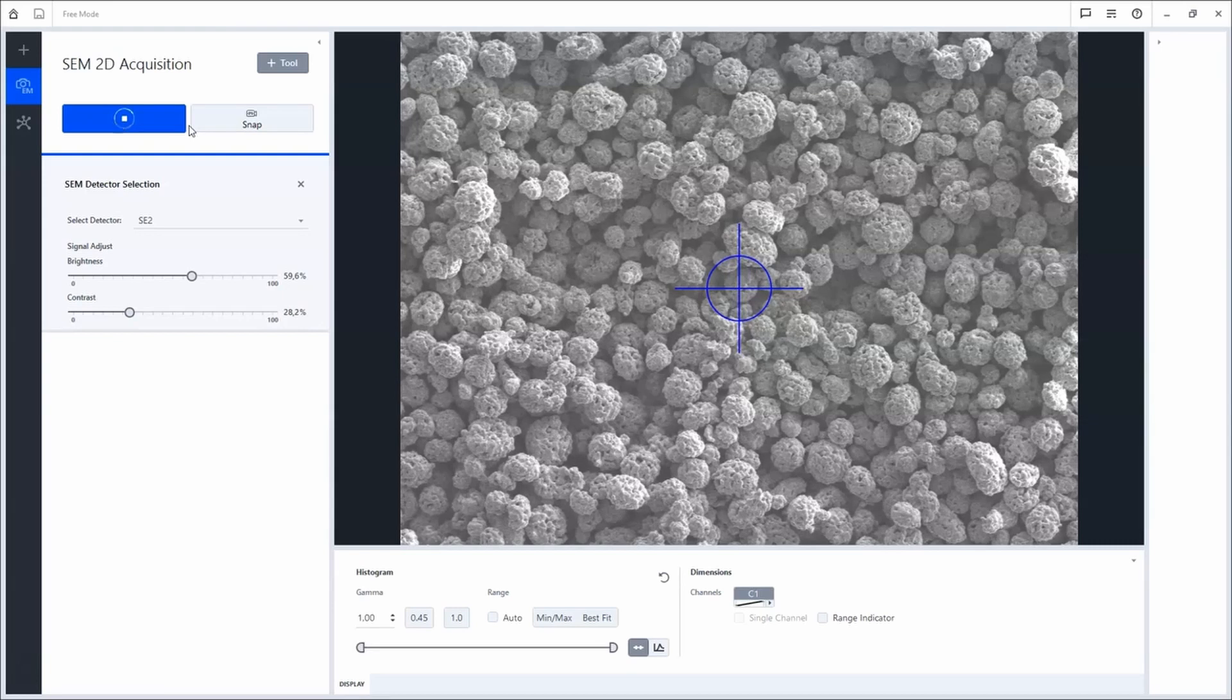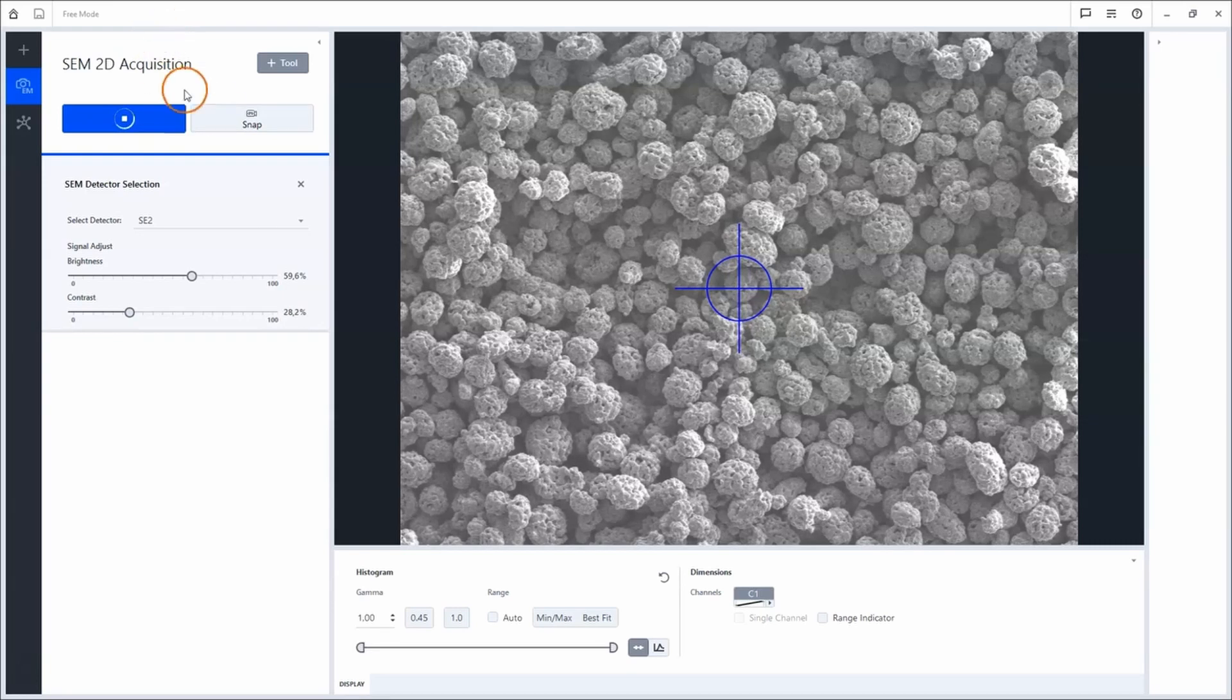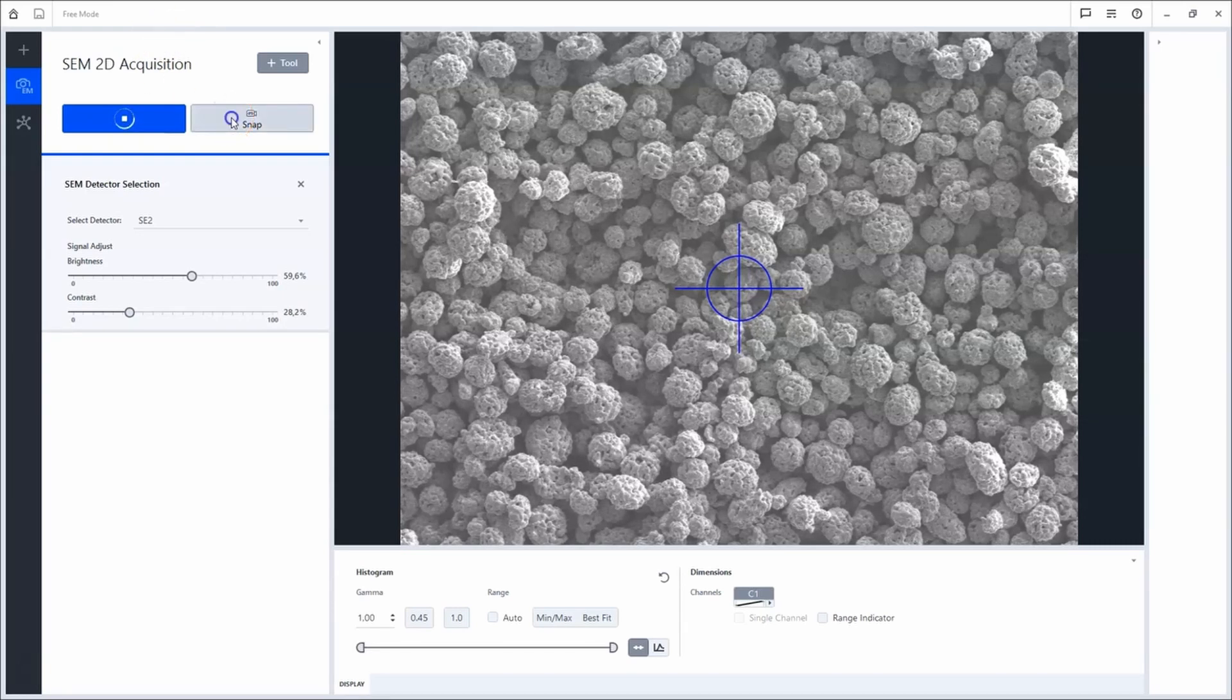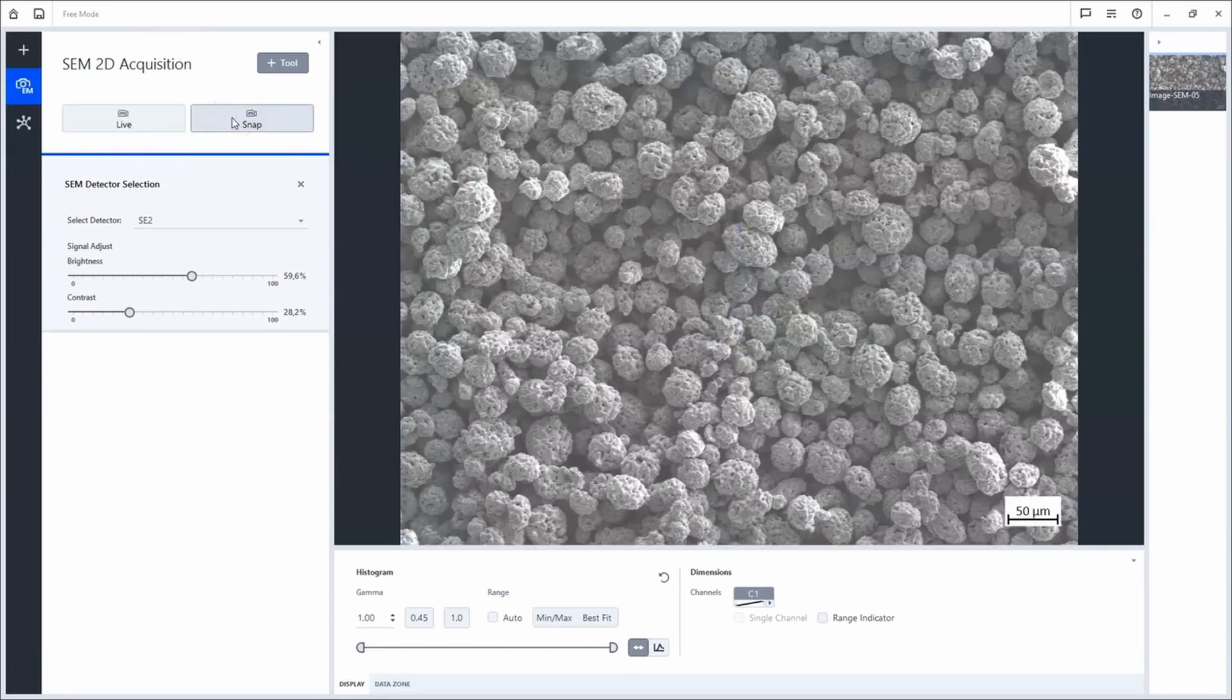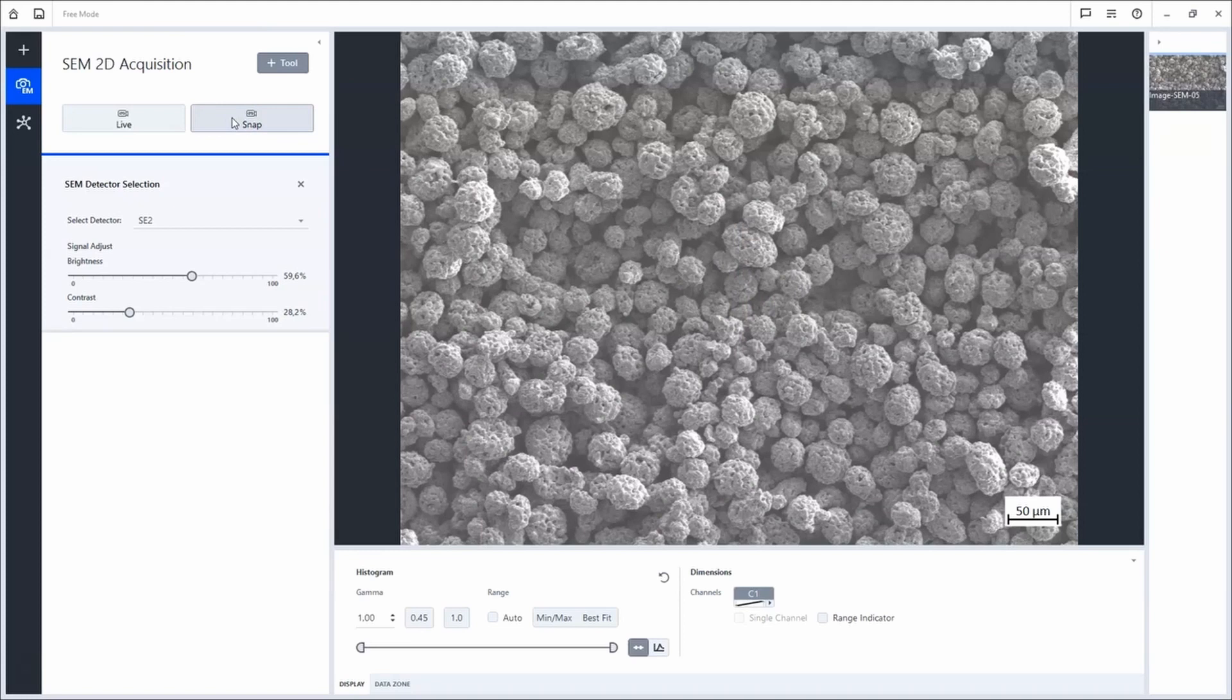To acquire the image, click Snap. The image will be visible within the image browser on the right side.